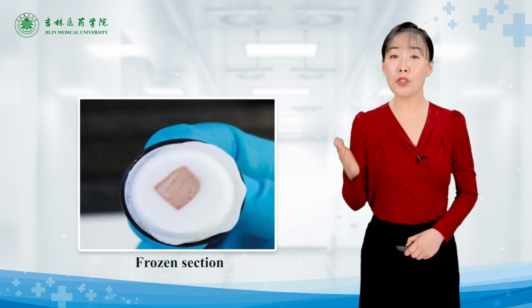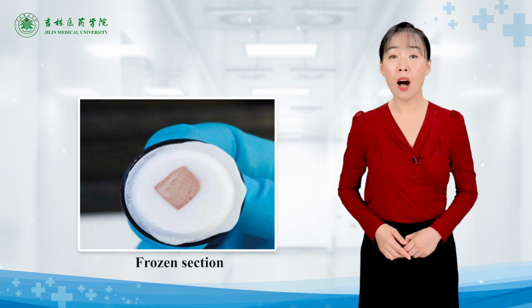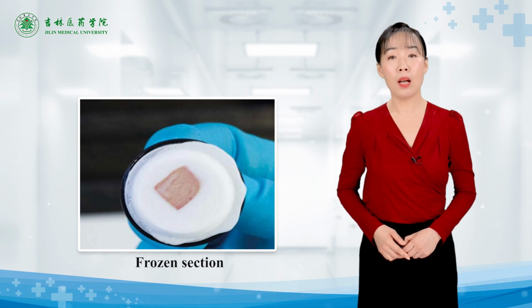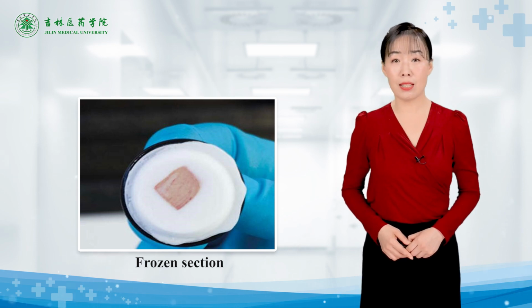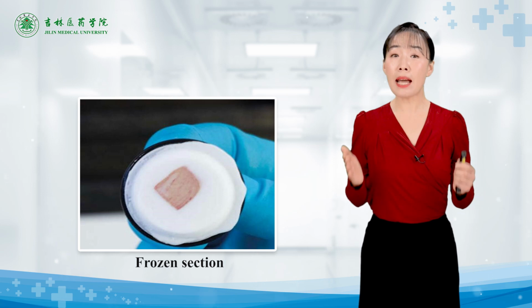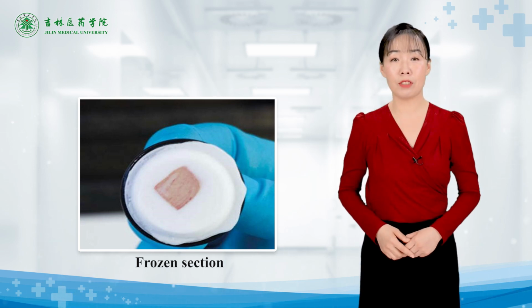In addition to the above routine paraffin sections, frozen sections of fixed or unfixed tissues may also be cut with a freezing microtome or in a cryostat. Since preparing frozen sections does not subject tissues to dehydration, clearing, and embedding, some chemical compounds and enzymes can be better preserved.